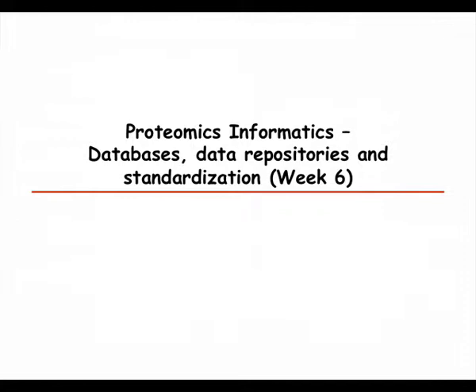But for example, on the data repositories front, the nice thing right now is that there are several repositories that seem stable, and hopefully at least have long-term support, so that the community can rely on them, both to deposit their data, but then also to retrieve other people's data and develop new methods based on that.